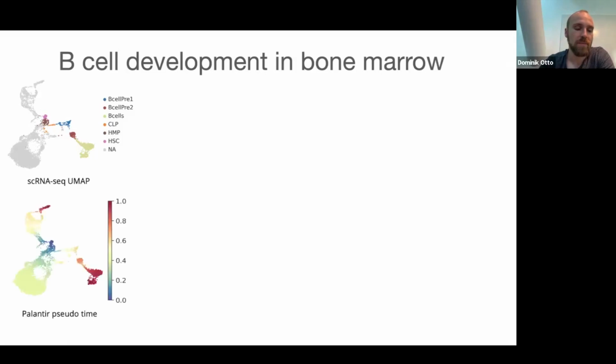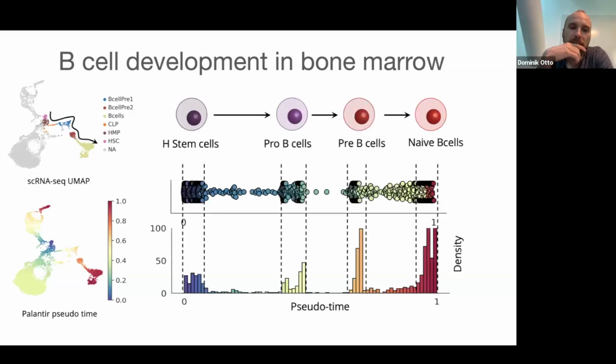Now, one common approach that we first do is to compute something called pseudotime. So this gives the cells an order in their temporal progression. We don't know if this is actually how fast the actual time is progressing. It just indicates which cells come first and what the intermediate states are and how to sort these cells if you want to look at something like gene expression development and so on. And here, if you depict this for only the B cell trajectory, we can already see that there's certain accumulation for known cell types, the described ones, which are more common, and something much more rare in between. But it's not quite clear from this picture if this is actually real or if this is just an artifact of how pseudotime is computed. But this is the motivation of looking into this more deeply and maybe finding something else than just annotating clusters and combining cells into clusters to understand the process.